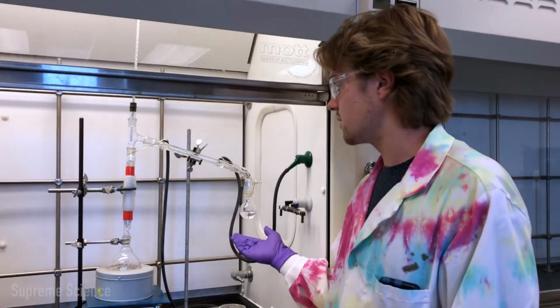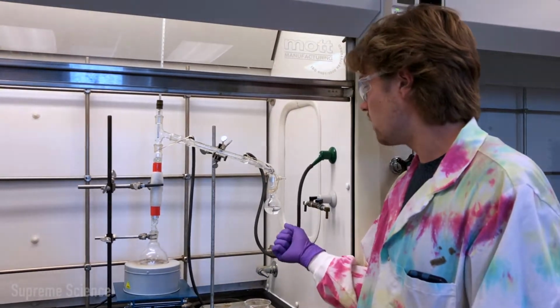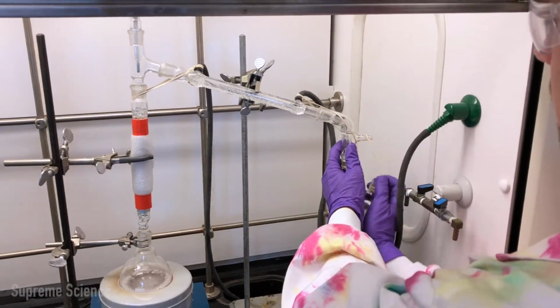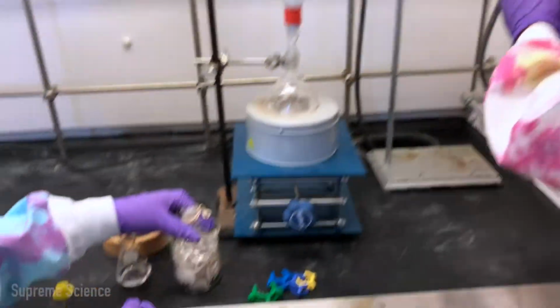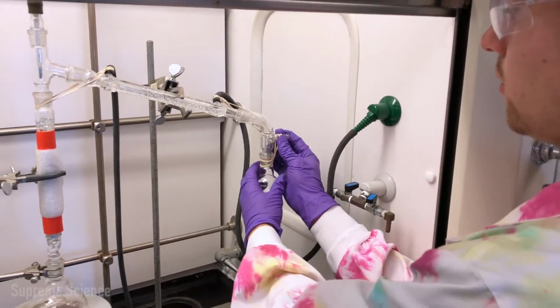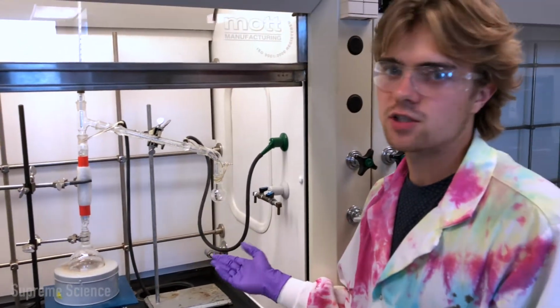Now we have our ethanol collecting in our receiving flask, and we're almost ready to switch to fill our next fraction. Very quickly, remove our old receiving flask and put the new one on. And we can put that in a beaker. Re-secure our new receiving flask with an elastic and continue the fractional distillation process.